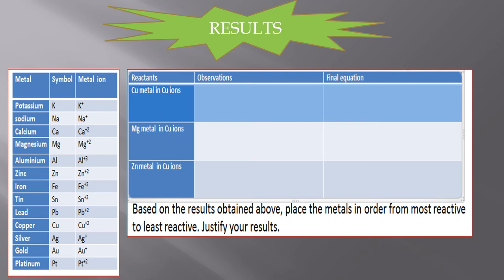So, come back to our results table. What should we see? Nothing for the first one. Magnesium is there on the reactivity series, and copper is down there. So, what do we see? We see the copper solution. Copper solution goes pale. And we see a brown solid on metal.